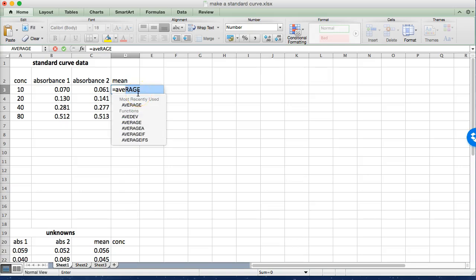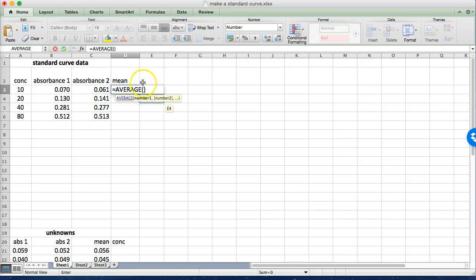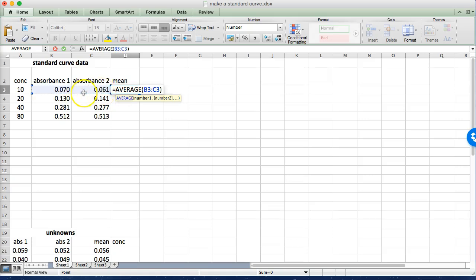If you've forgotten what the formula is that you want to use you can always go to the formula ribbon and find it that way. And then we want to select the cells that we're going to use to calculate the average. So we're going to use this cell and this cell. So we just click and drag.